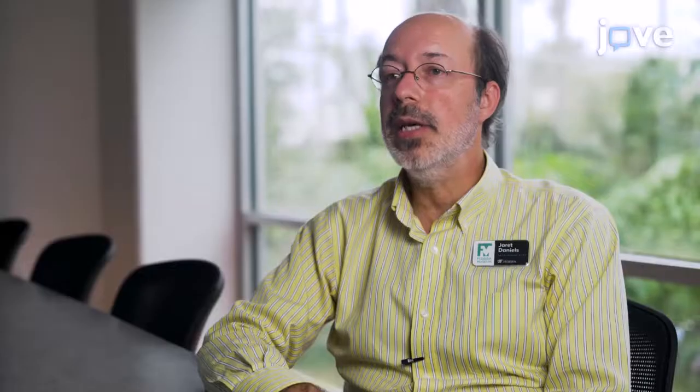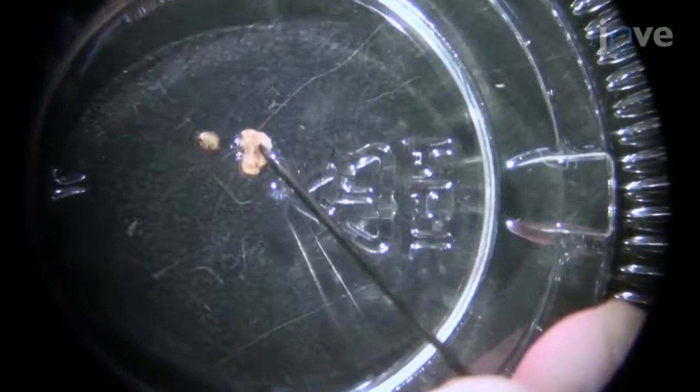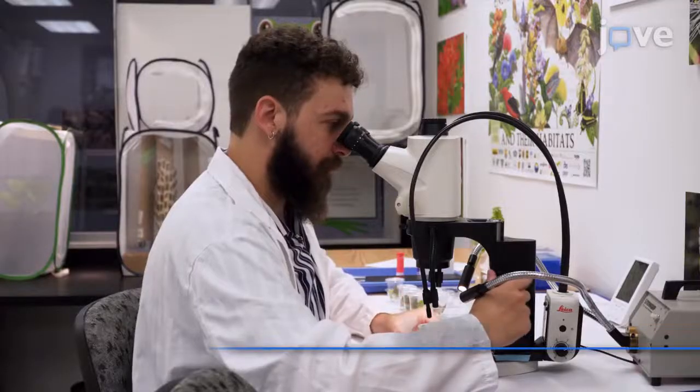This method requires dexterity and attention to detail to avoid organism harm, as butterfly larvae are very small, especially as neonates. Demonstrating the procedure will be Jacob Hornfelt, an undergraduate from our laboratory.